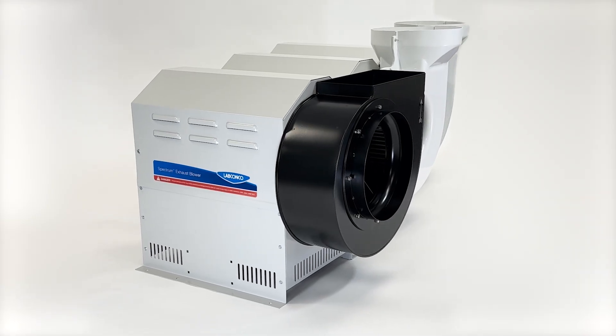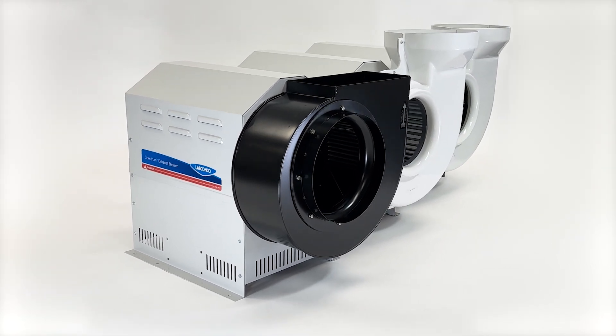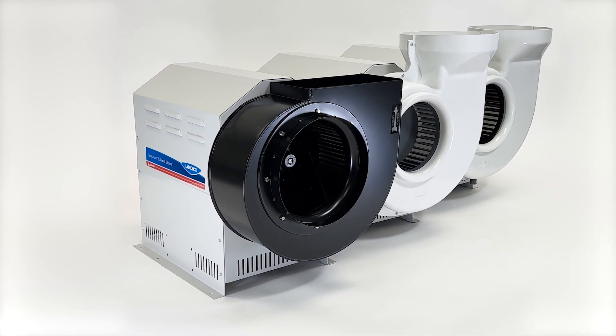LabConco's Spectrum exhaust blower has an unprecedented performance range and onboard intelligence, allowing it to seamlessly integrate into building management systems with ease.